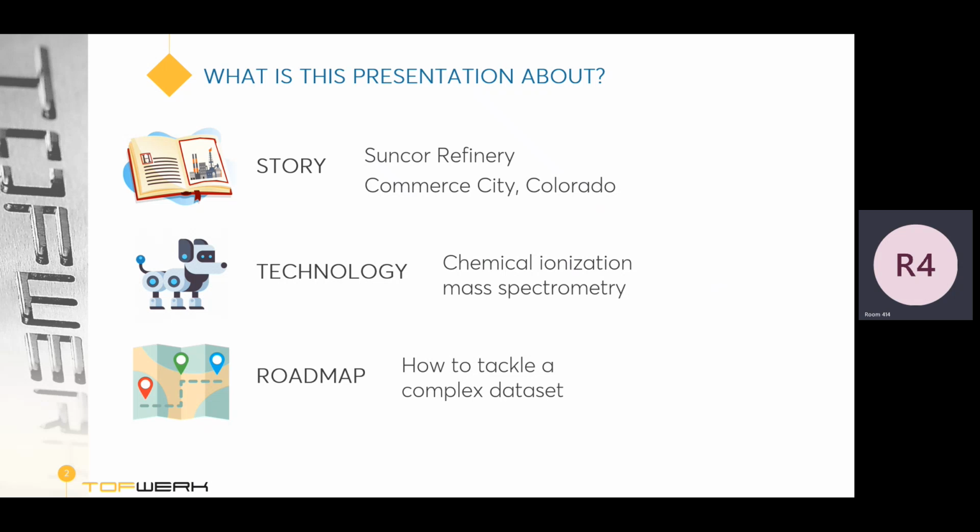Secondly, technology featured prominently. I will tell you about PTRMS because I love PTRMS. And the third aspect of this is strategy. So this is a roadmap or a workflow. With this modern instrumentation, that's really high performance, real-time mass spectrometry, you get thousands of data. There's a way to measure nearly any kind of gas-based compound that you can possibly. So this is a workflow to figure out what's important when you can actually measure everything.